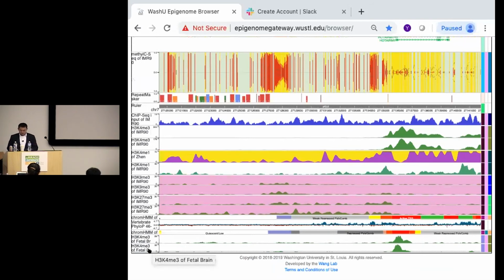So this is how you select tracks. Okay, you've done all this work. Time for coffee, time to go home, time to power off your computer. You probably want to come back to this hard work, right? So you don't remember what you did. So, next time when you come back, you can recreate this. Honestly, I won't be able to recreate this because we did everything sort of on the fly, right?